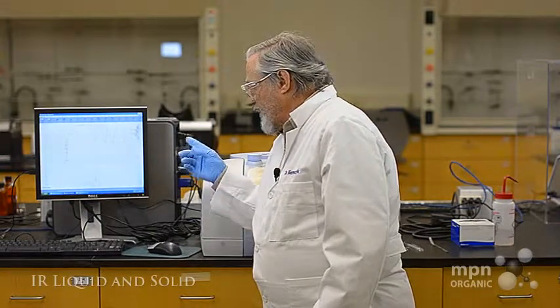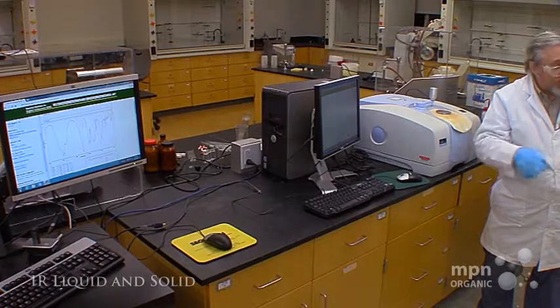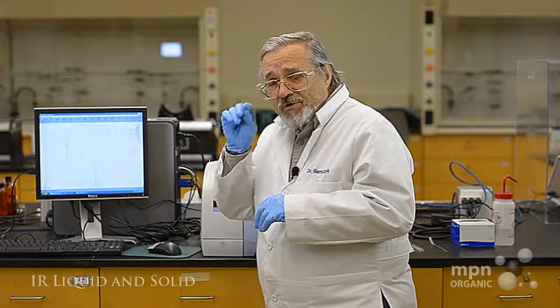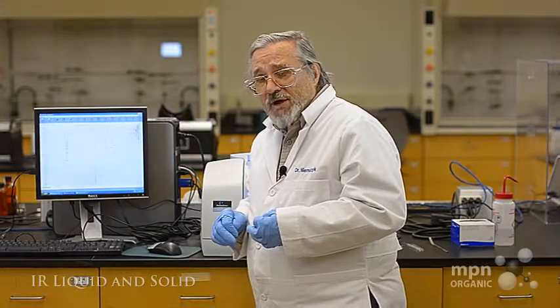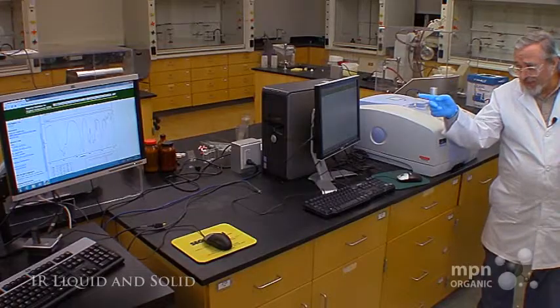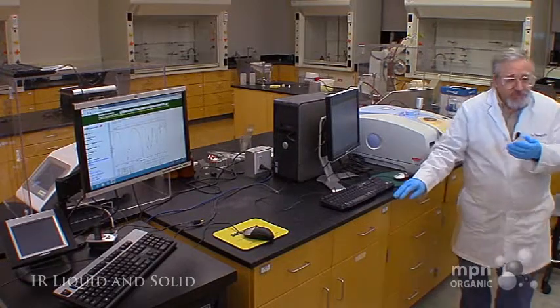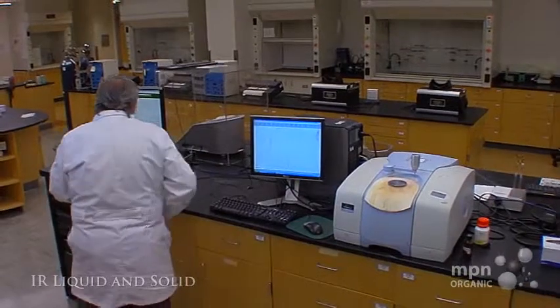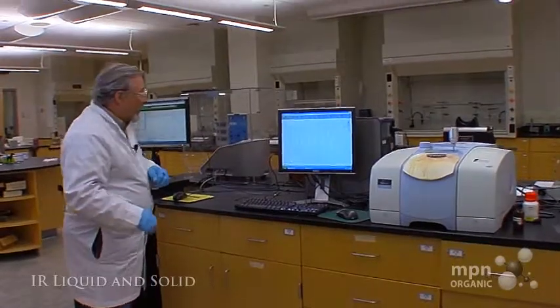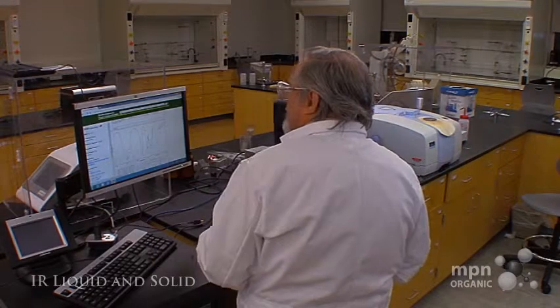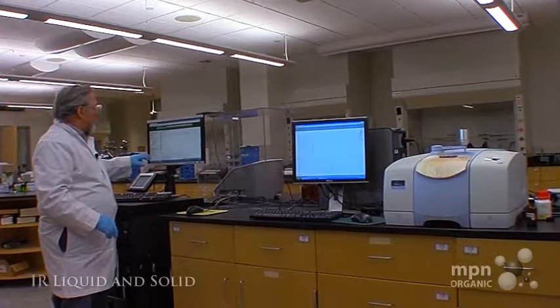So what we want to do now is to go over to the computer program called SDBS. You just type in SDBS on Google, and you hit the title for SDBS, and it will bring up a program which you can now use to identify this particular material. I'm going to walk over here now to this computer on which we have the program SDBS already booted up to nonanoic acid.